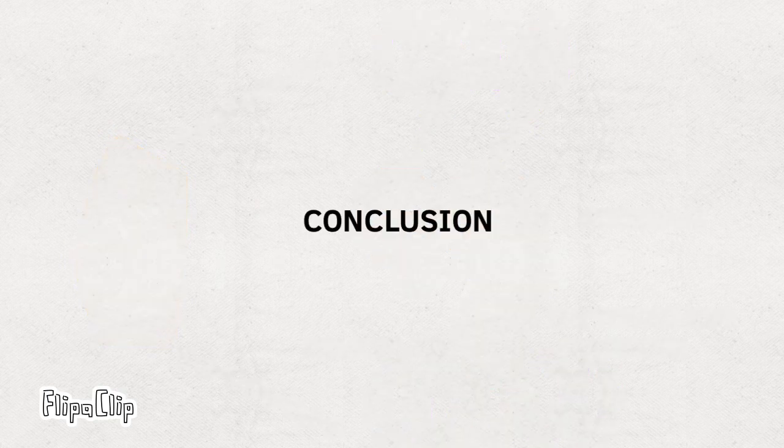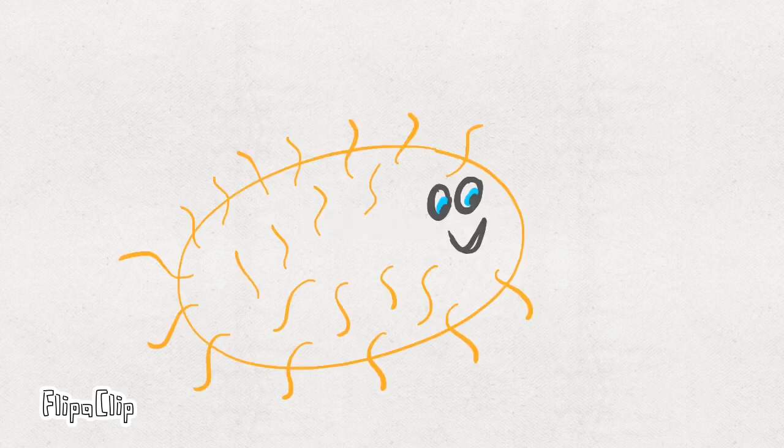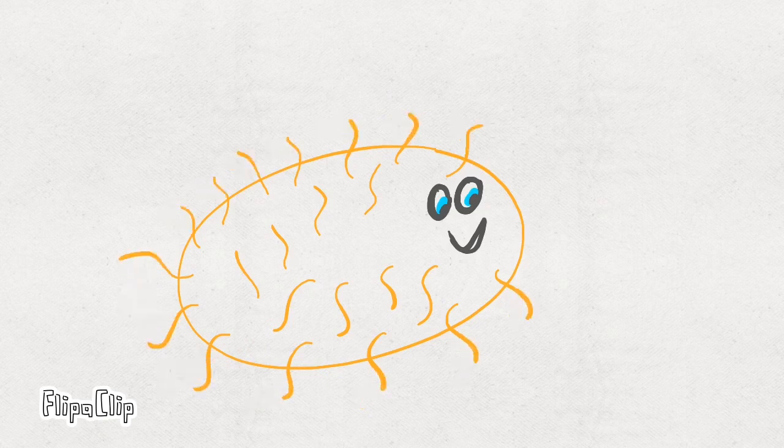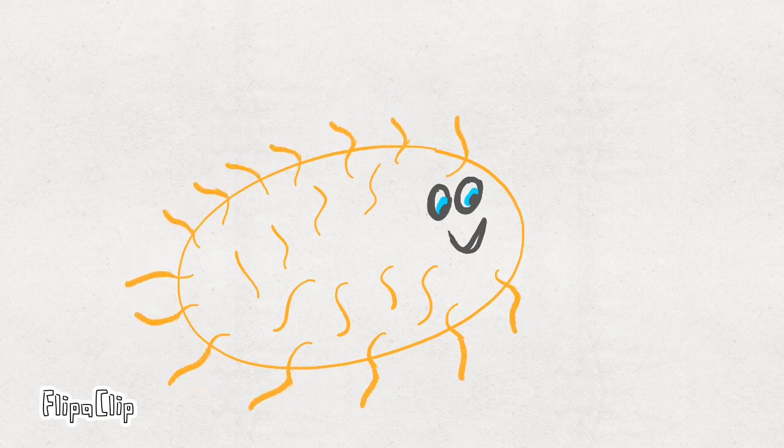The overall goal of this experiment is to determine whether our gene of interest, LC7A, which is located in the light chain accessory protein and is responsible for dynein attachment and ciliary bending, plays any role in the impact of cilia motility in Tetrahymena. We use DNA isolation, primer design, polymerase chain reaction, cloning, ligation, transformation, and confirmation. A final transformation and confirmation determine the overall success of our knockout gene.